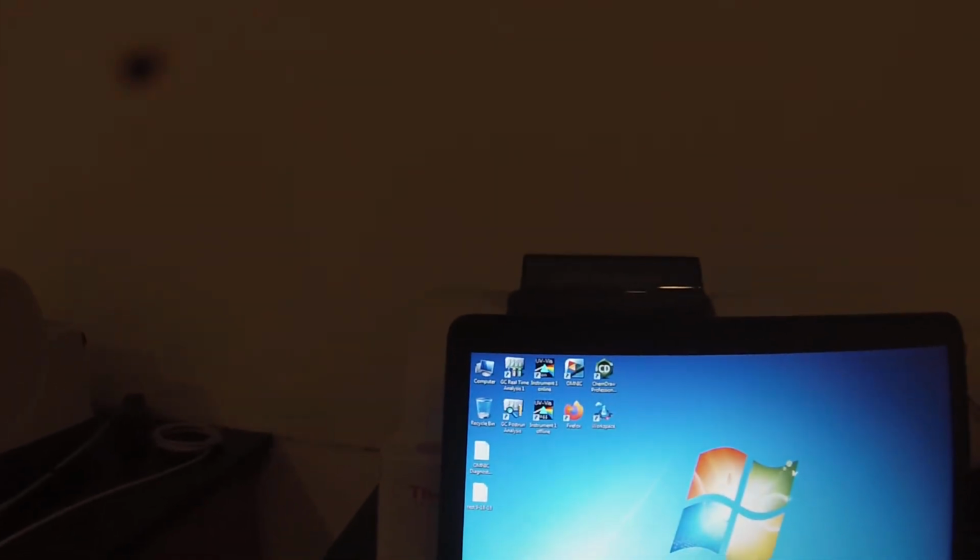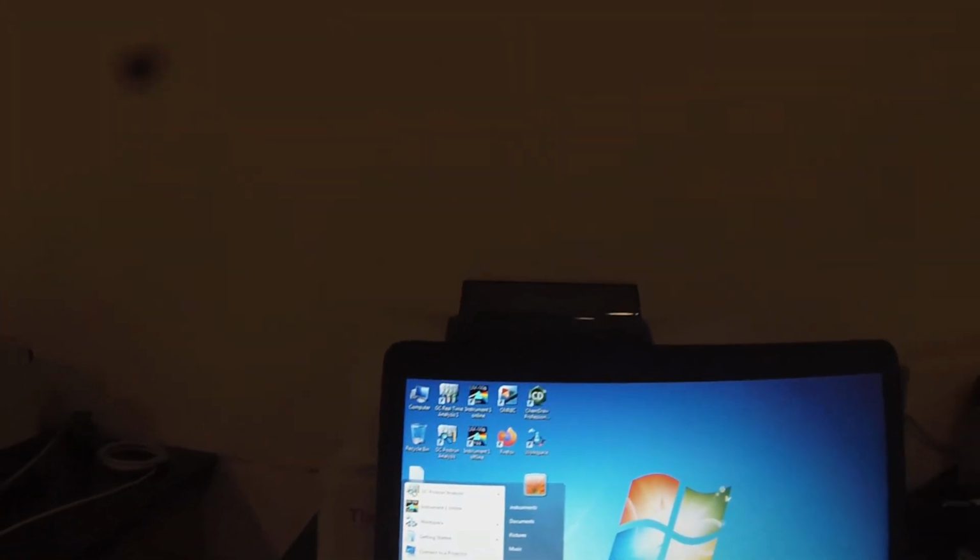So we definitely made an ester. Probably it's a 7 or 8 carbon ester, from a 5 or 6 carbon alcohol. Save those changes, why not? Close up Omnic. Get this guy back to sleep. And take my sample out.